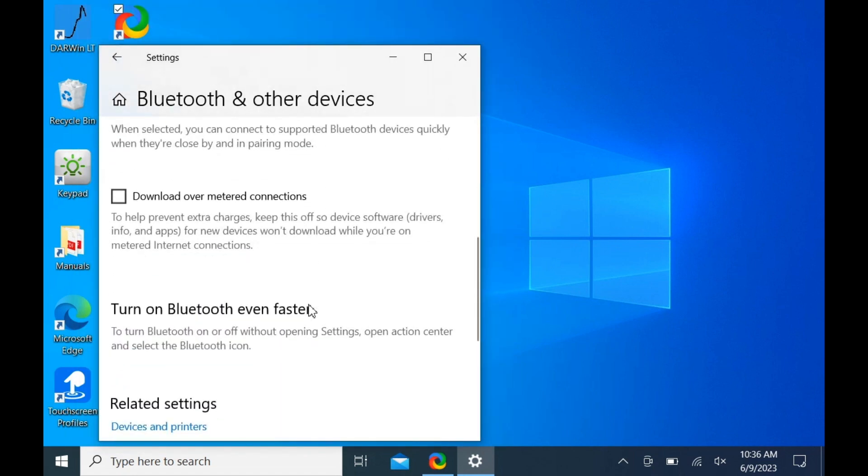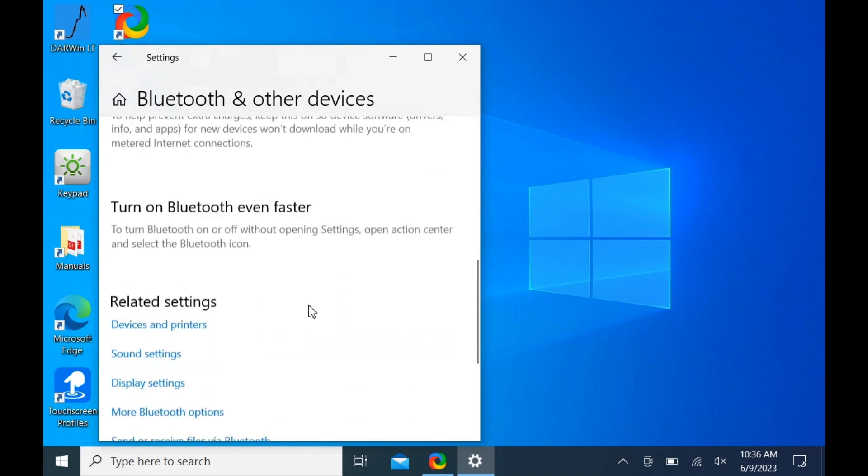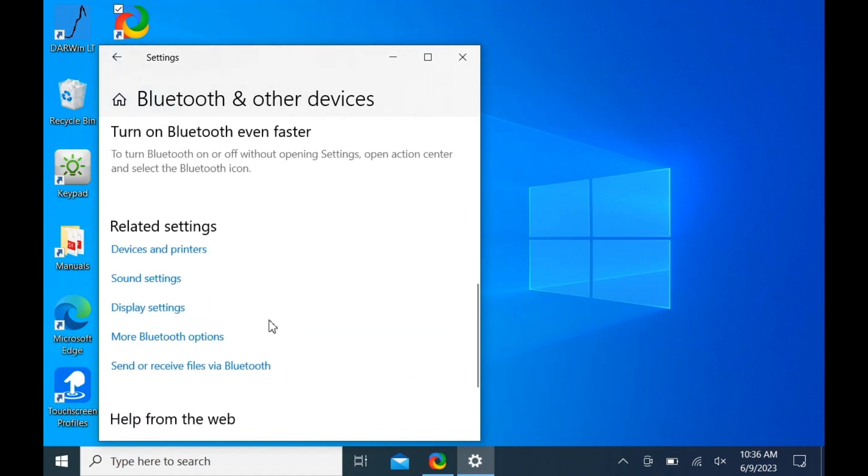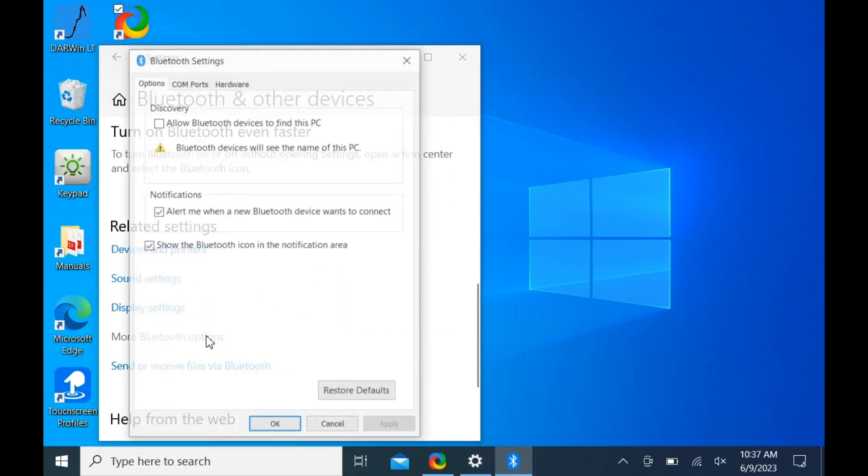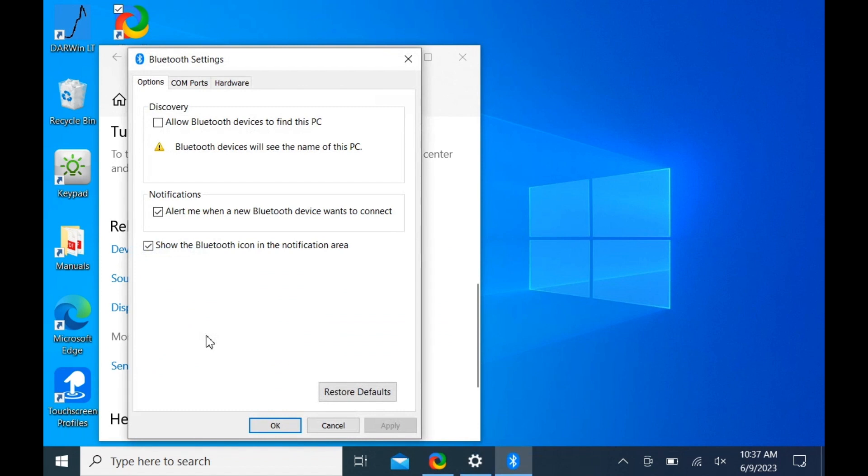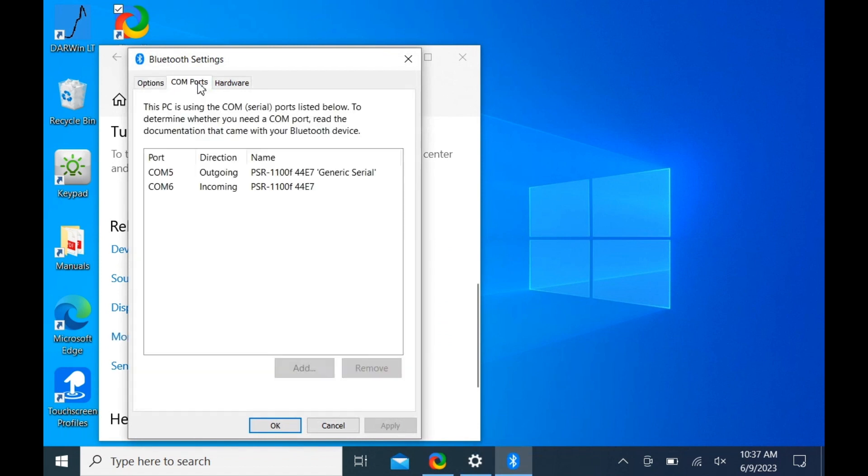Then scroll down to the related settings and click more Bluetooth settings. Click on the COM ports tab and make note of the outgoing port labeled with your system and generic serial.